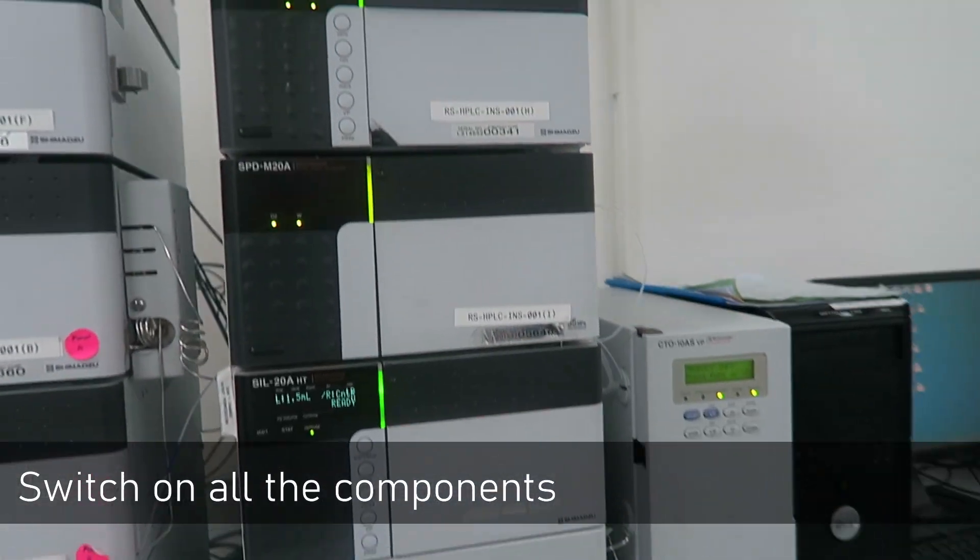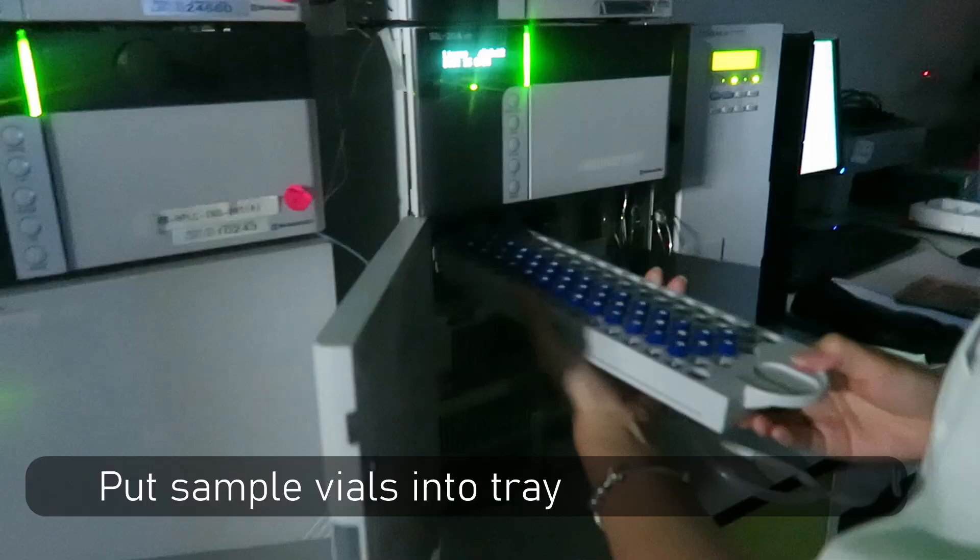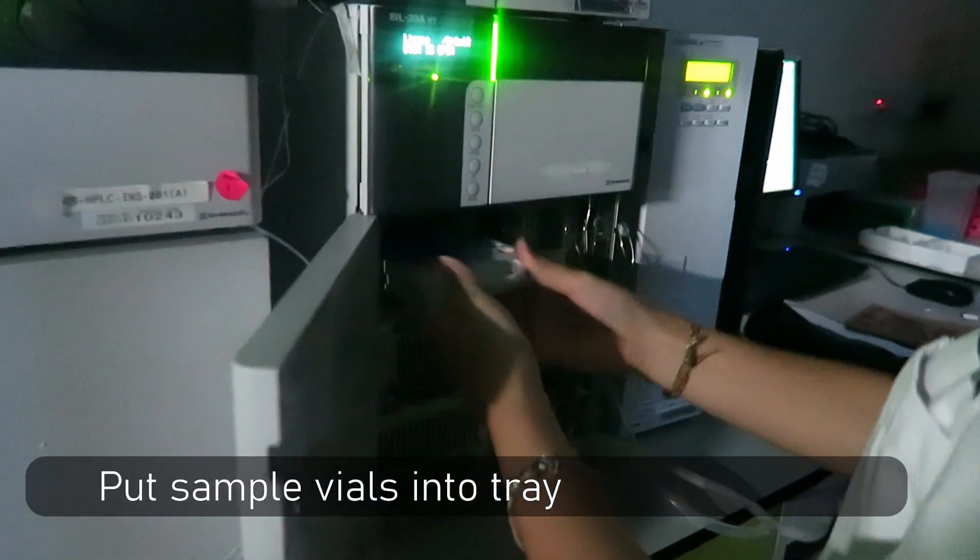First, switch on all the components. Then, put the sample vials in the tray.